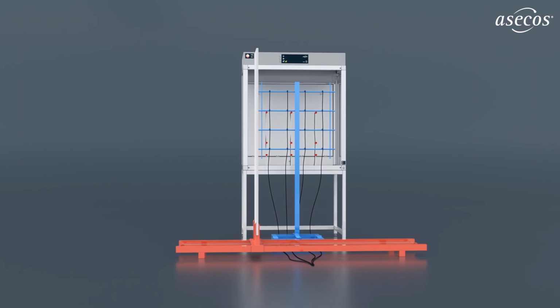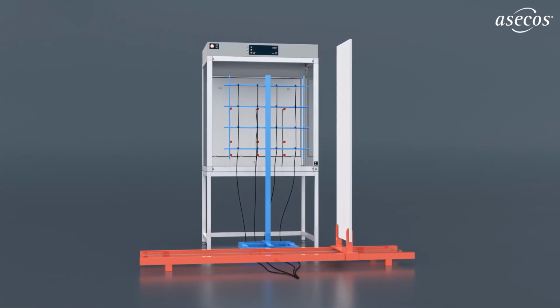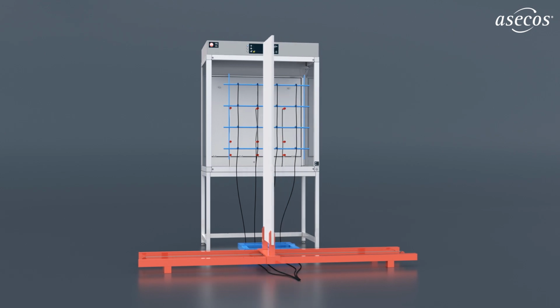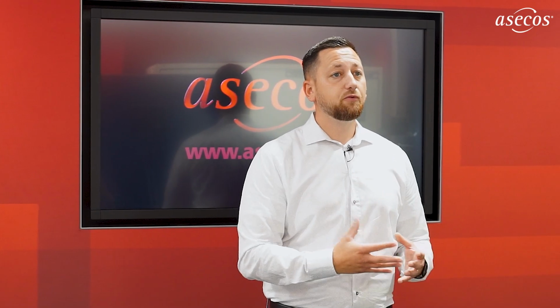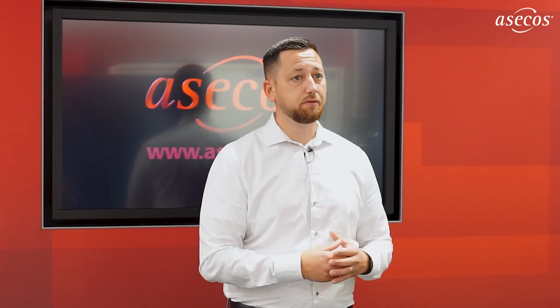We have tested this in accordance with the BS EN 14175, Part 3 ventilation test. This so-called robustness test verifies the retention capacity even in the event of disruptive external influences. The test limit value of 0.65 ppm outside the device is not exceeded, thus confirming the effectiveness of the hazardous substance workstations.